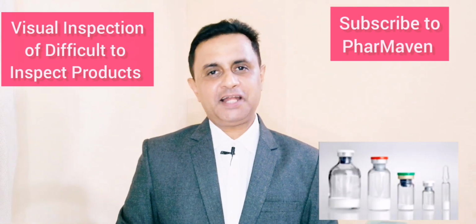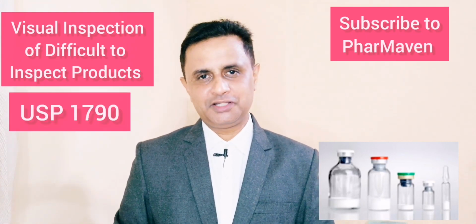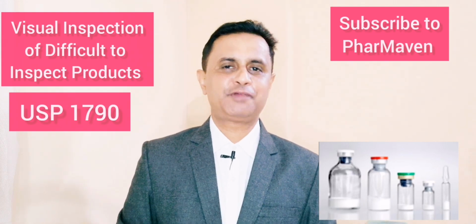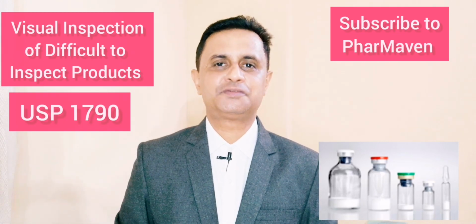What reference guidance can we use to enhance our procedures? USP 1790. Yes, USP 1790 is the reference guidance. It is about the visual inspection of injectable products. It guides us on how we can inspect products which are difficult to inspect.